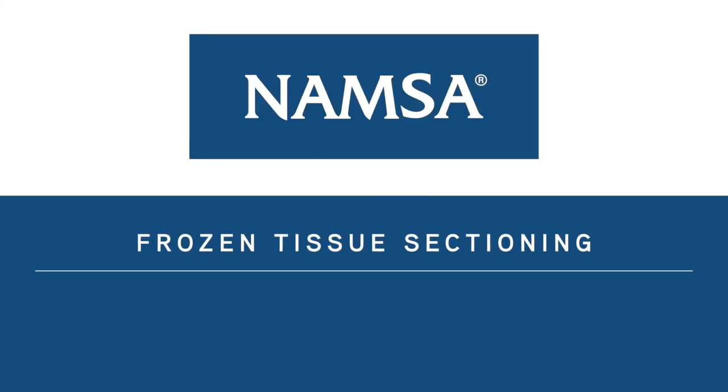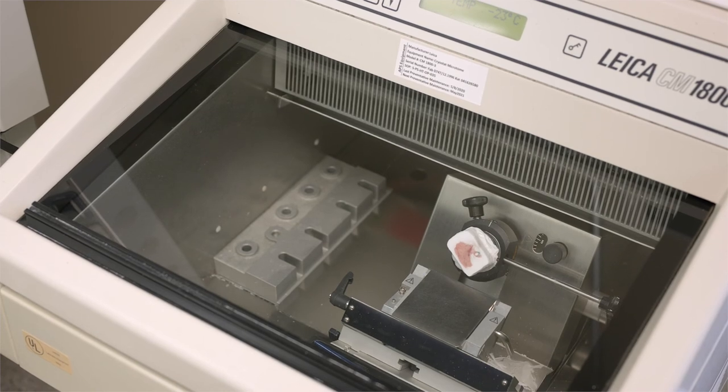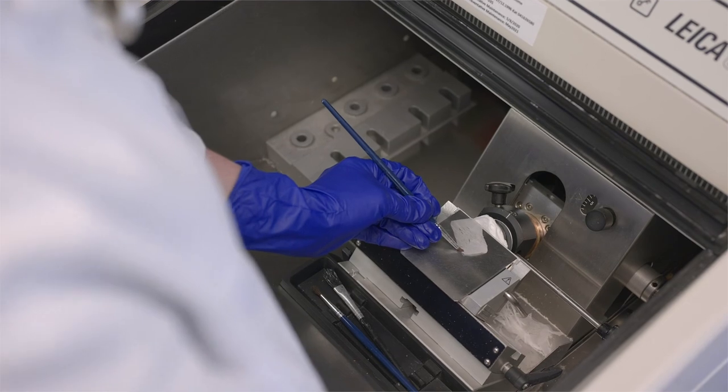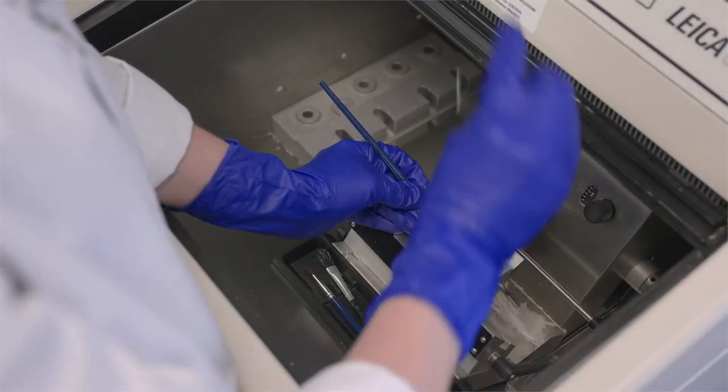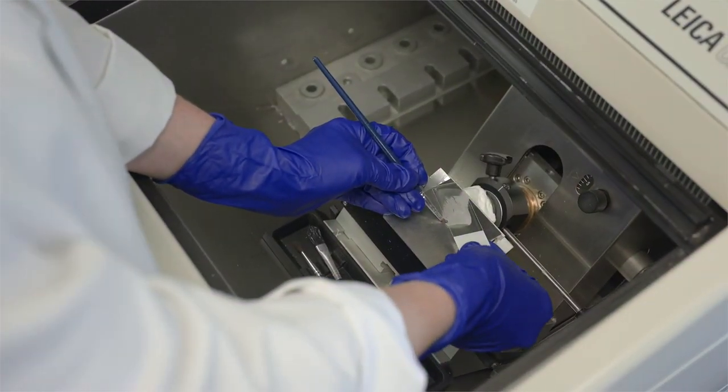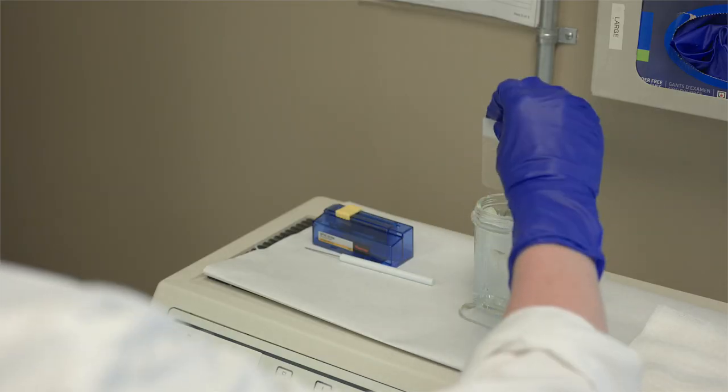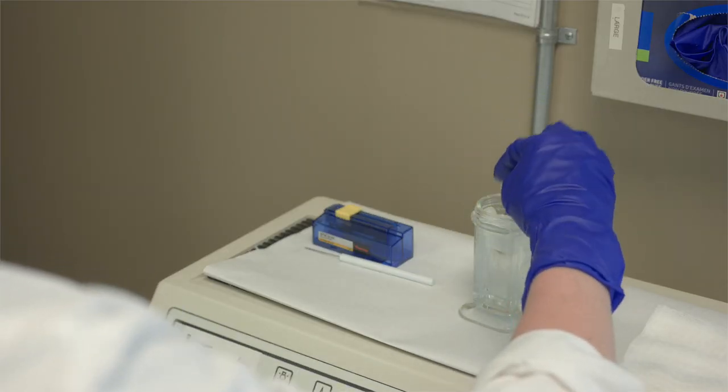Frozen tissue sectioning. If study samples cannot be exposed to formalin or other fixatives, tissue without devices can be frozen, cut on a cryostat, and stained with H&E. This is currently an infrequent process. Additional stains can be developed based off of client request.